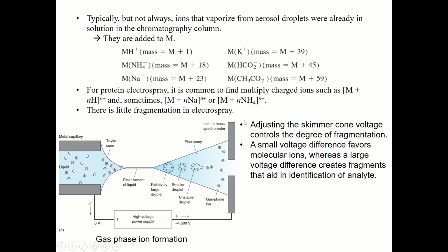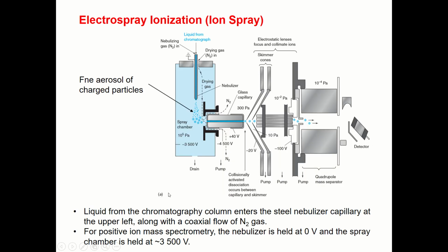Let's look at this blown-up figure. This is the metal capillary, and a high voltage is applied. And this is a nebulizer. This is the inlet to, let me see, I'm sorry, this is not the nebulizer. This is the metal capillary.